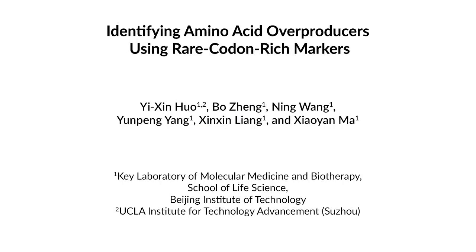This method provides an efficient alternative to the conventional analog-based approach in obtaining amino acid overproducers. This technique outcompetes the traditional analog-based method by providing accuracy, sensitivity, and high throughput simultaneously. This method sheds new light on understanding amino acid overproduction strengths and the translation of rare codons, and could theoretically be applied to all microorganisms.